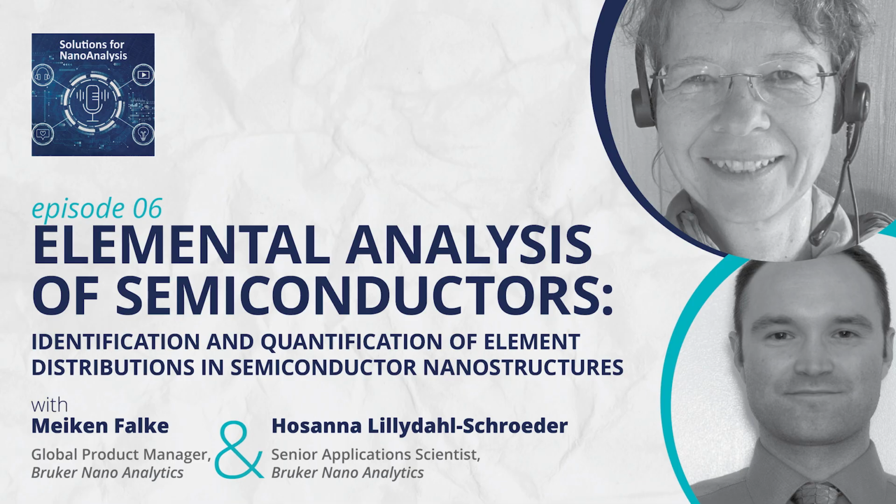All right. So from what you're saying, it sounds like EDS is a very mature technique and well suited for identifying many different elements in the semiconductor industry. Are there any particular examples where EDS has provided answers to particularly challenging topics, or do any other interesting applications stand out to you?